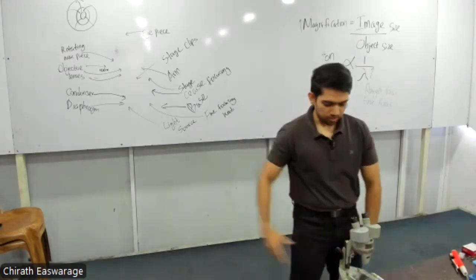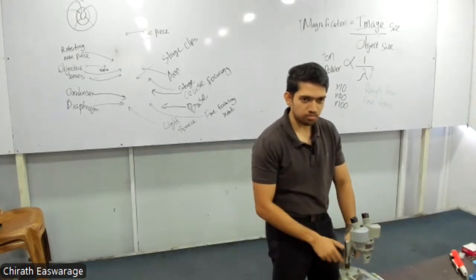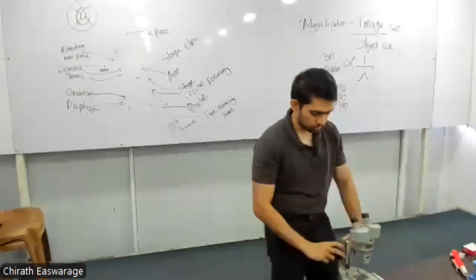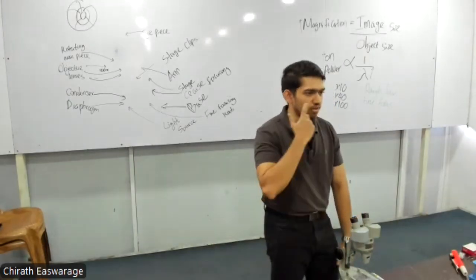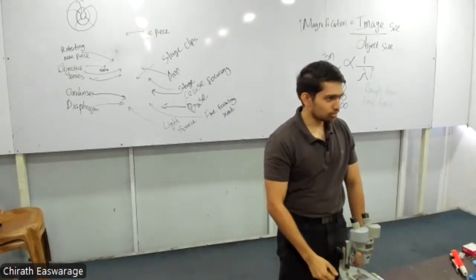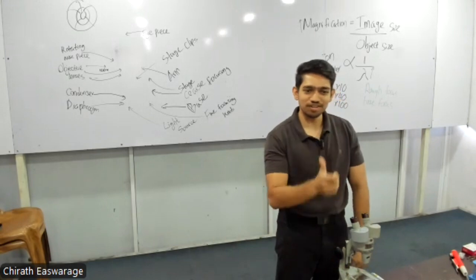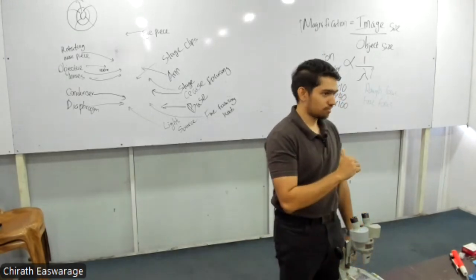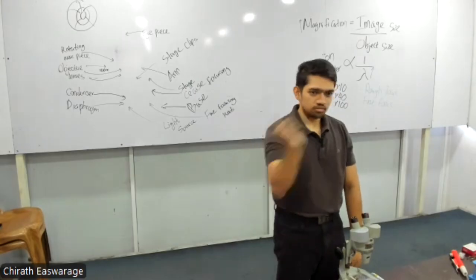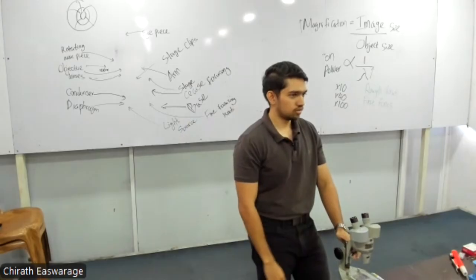Because if you go and change the coarse focus, the next person, in the 30 seconds, maybe 20 seconds, has to change the focusing. So the rough focusing will be done for you, but depending on your vision, you have to adjust somewhat. That will be done by the fine focus. You're only allowed to touch the fine focusing. If they see you touching the rough focusing, they tell you to move on, and the exam will be paused until the focus is correct.